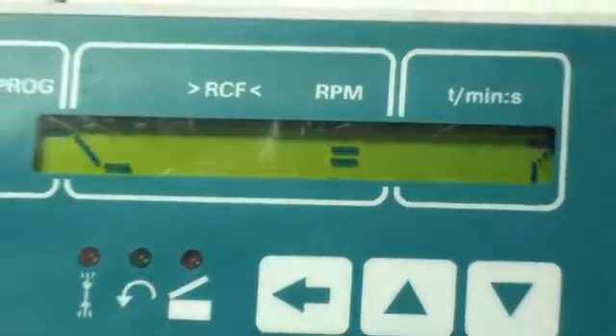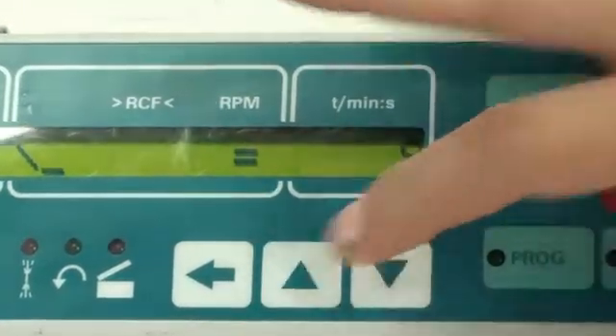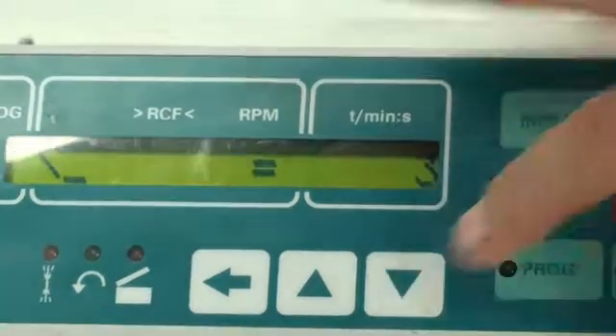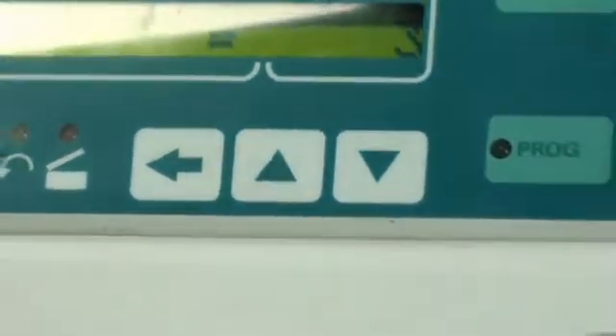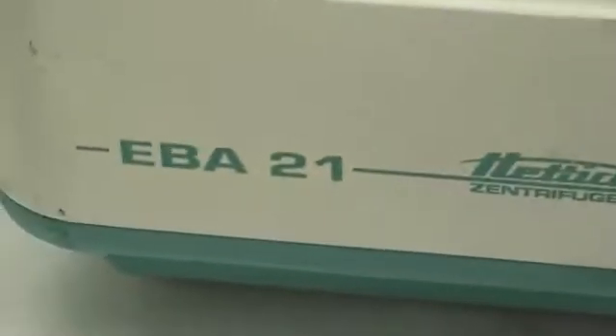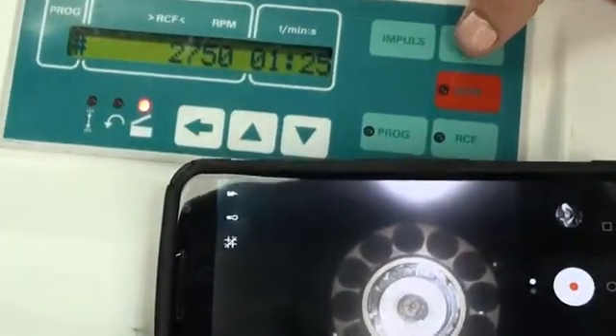And then near the end, how you want it to stop is also programmable. So if you want a sharp stop, you can go high. Or if you want it to slow down slowly, you can lower the number. Now that our information is programmed, I'm going to go ahead and make sure to close the door — it's ready to go. One feature I'm going to share with you guys is the inside; we have a camera that will show you how well it works. I'm going to go ahead and press start.